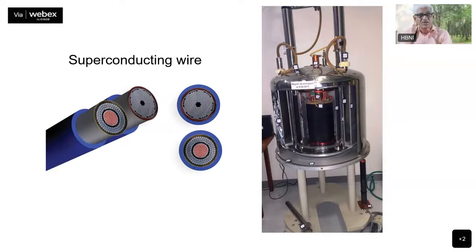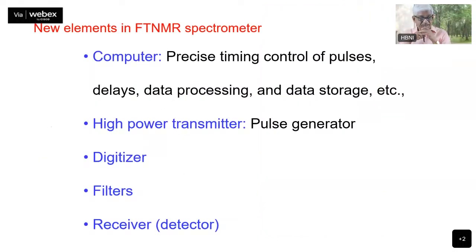So whenever there is a quench or anything like that, then of course the energy has to be dissipated immediately, and there the copper becomes very helpful. And that is why it is designed in this manner. And where it is kept, and the design of that is shown here.